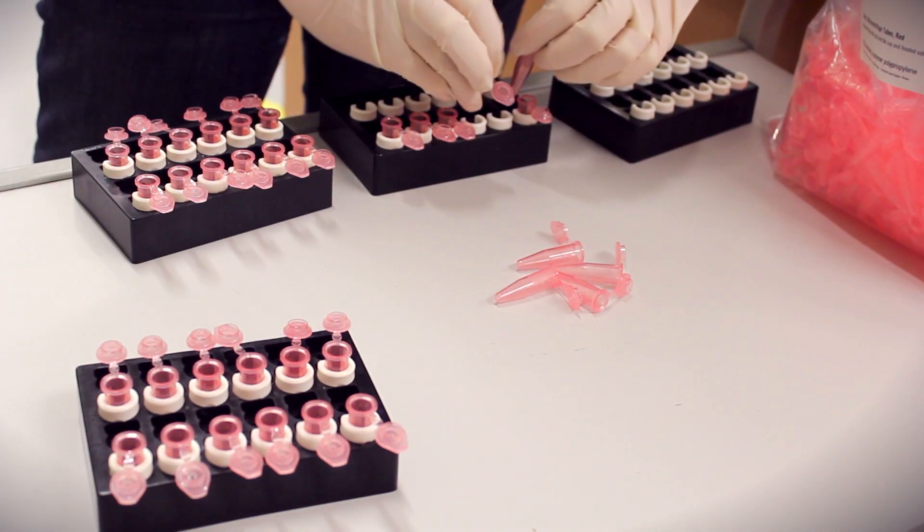We're very good at cloning things - that's all we do. We're also very experienced protein purification people.